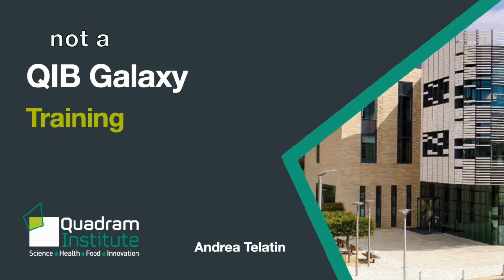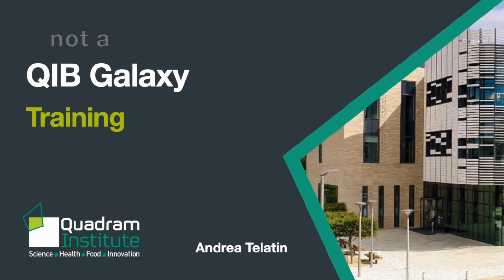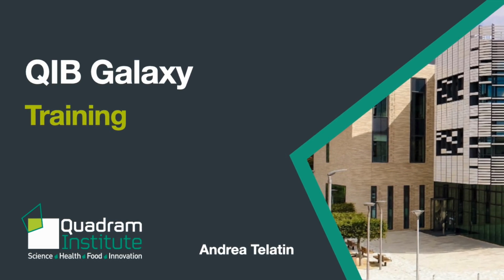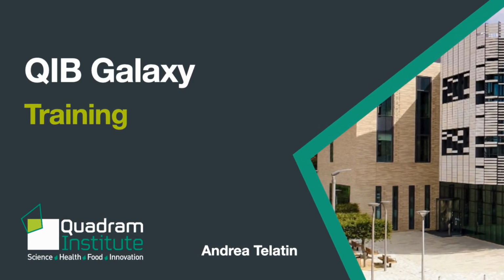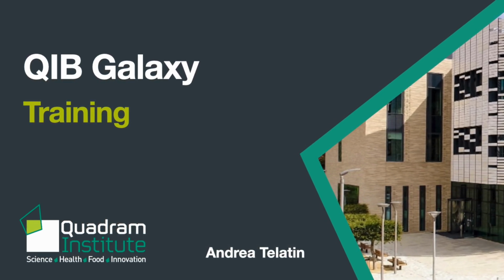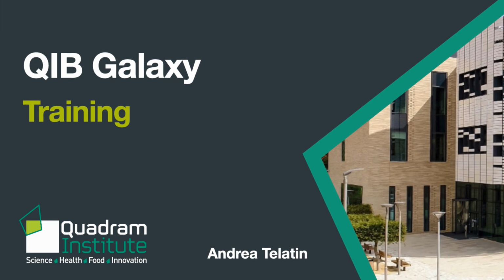Welcome to a short introduction to Galaxy at QIB. This is not a full Galaxy training, but rather a short overview of the instance that we have specifically at QIB, specifically mentioning a couple of tools that make it special.